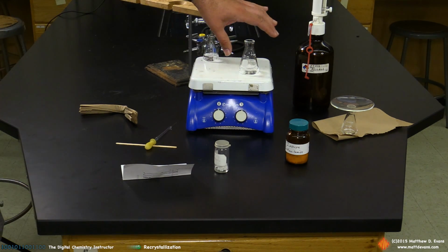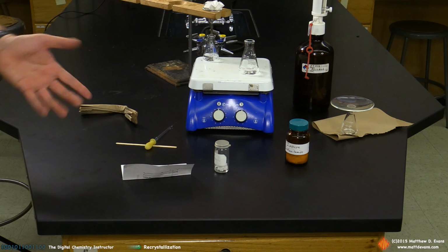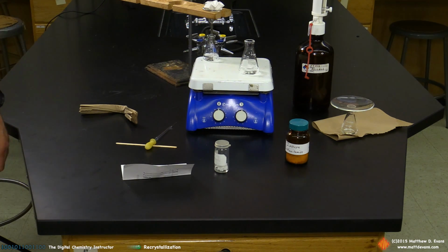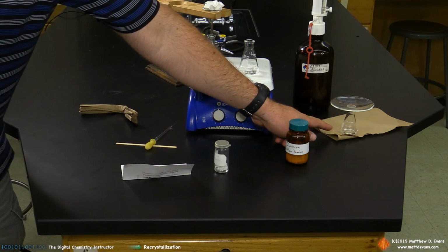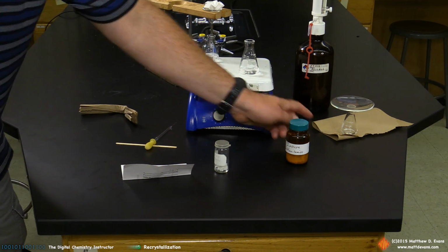And as soon as it's cool enough to touch, get it off the hot plate, get it cooled down to room temperature, get it into an ice bath as quickly as you can. All right, so we're going to wait for these crystals to crystallize. We're going to wait for this until we can touch this with our fingers. This is going to go into an ice bath.